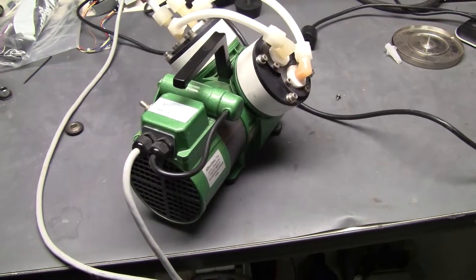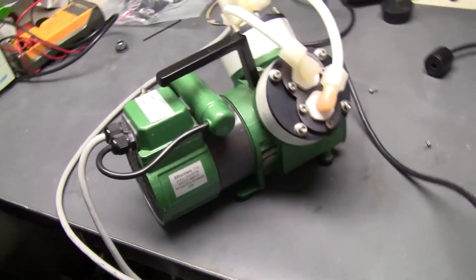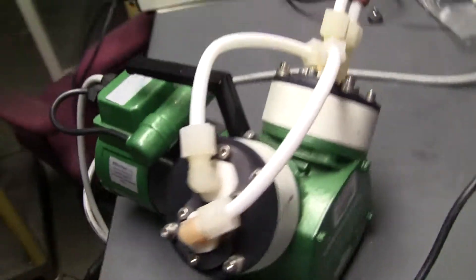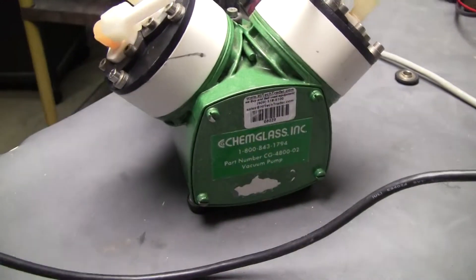Hi, this is Michael Nathia from Hitech Trader. Today we're looking at a K&F, or ChemGlass, vacuum pump.